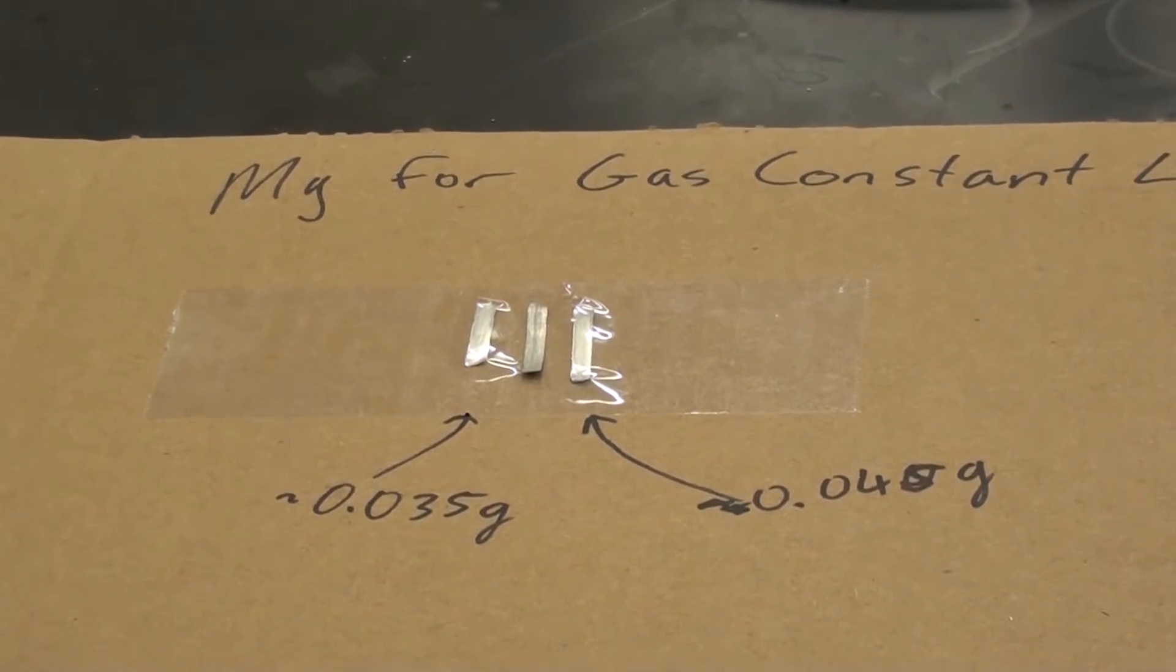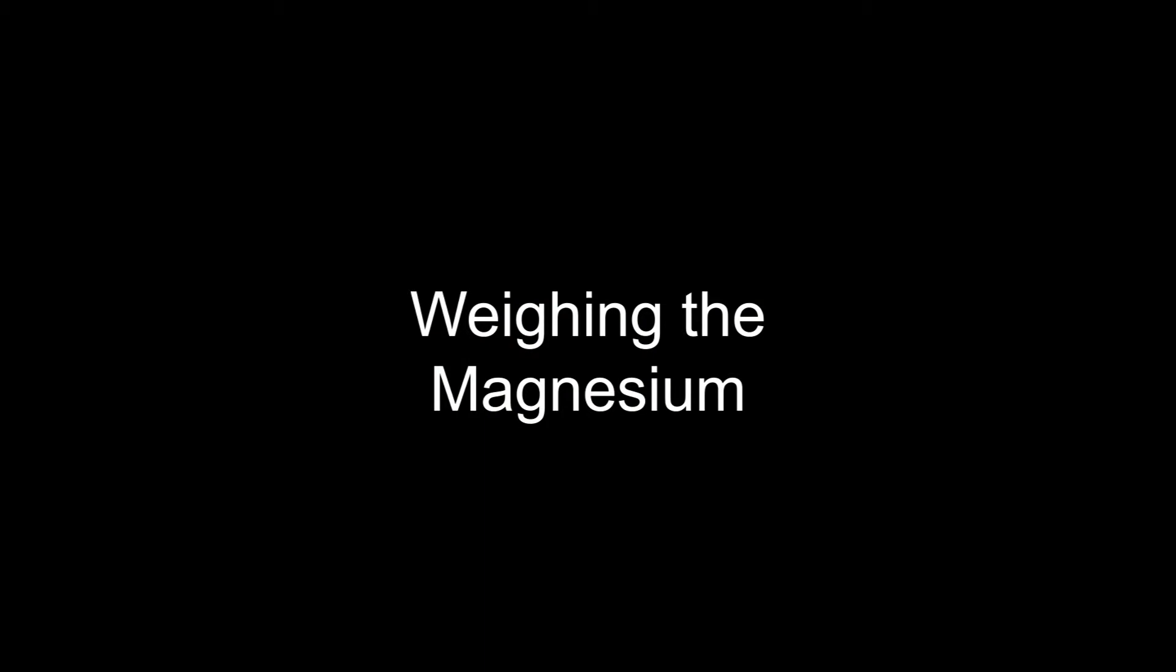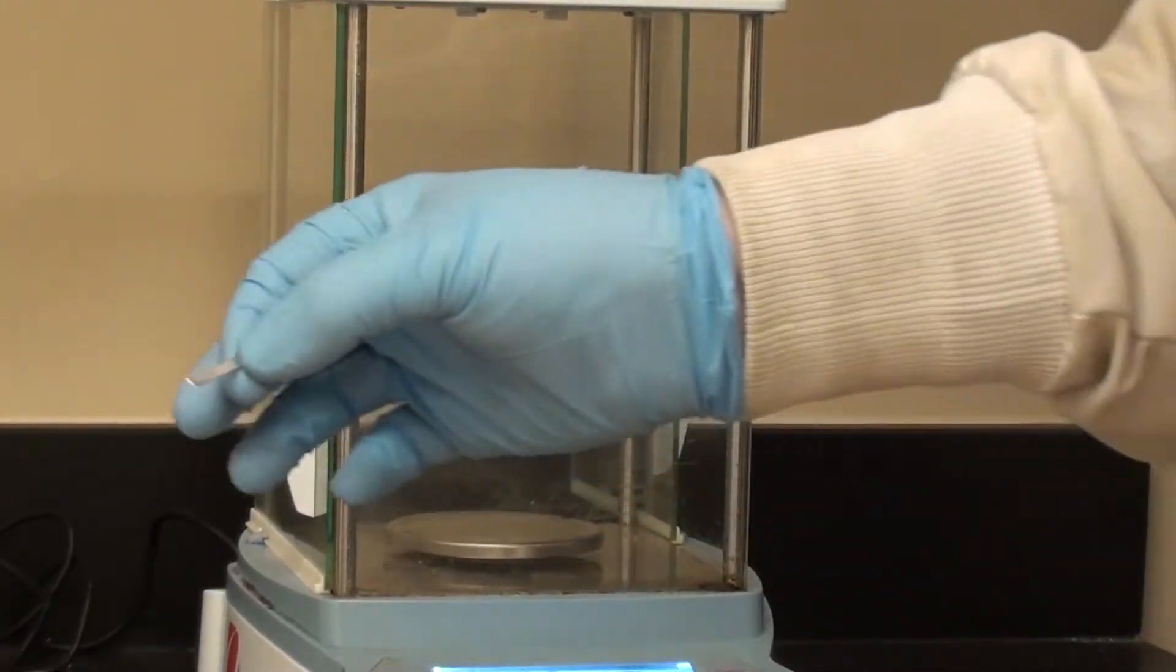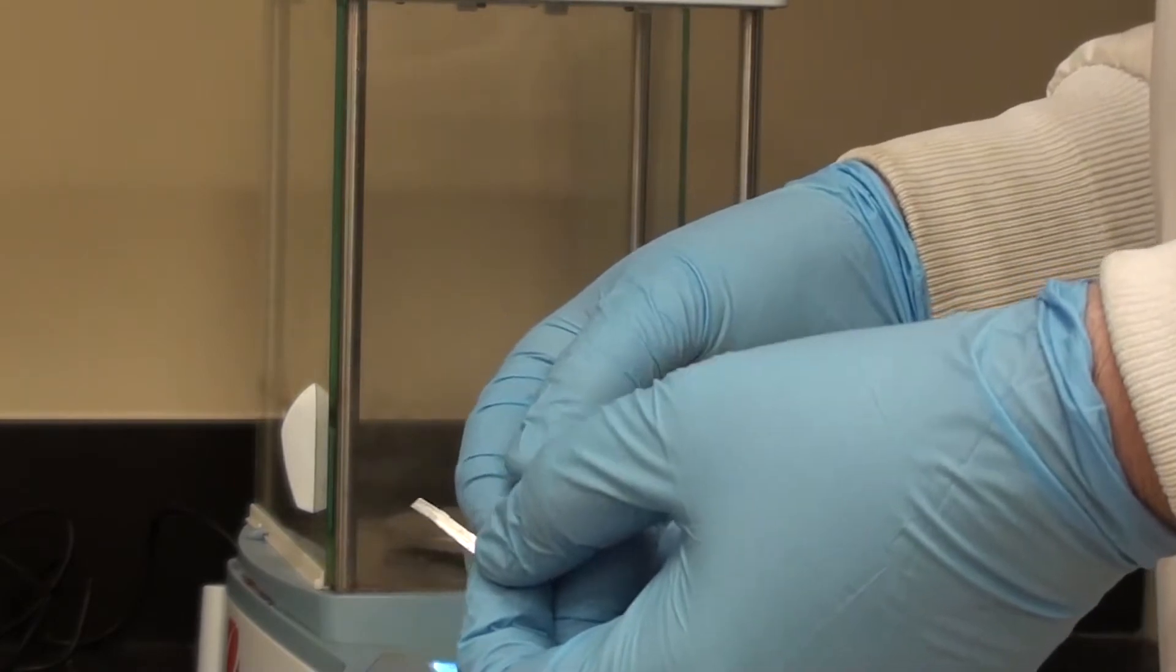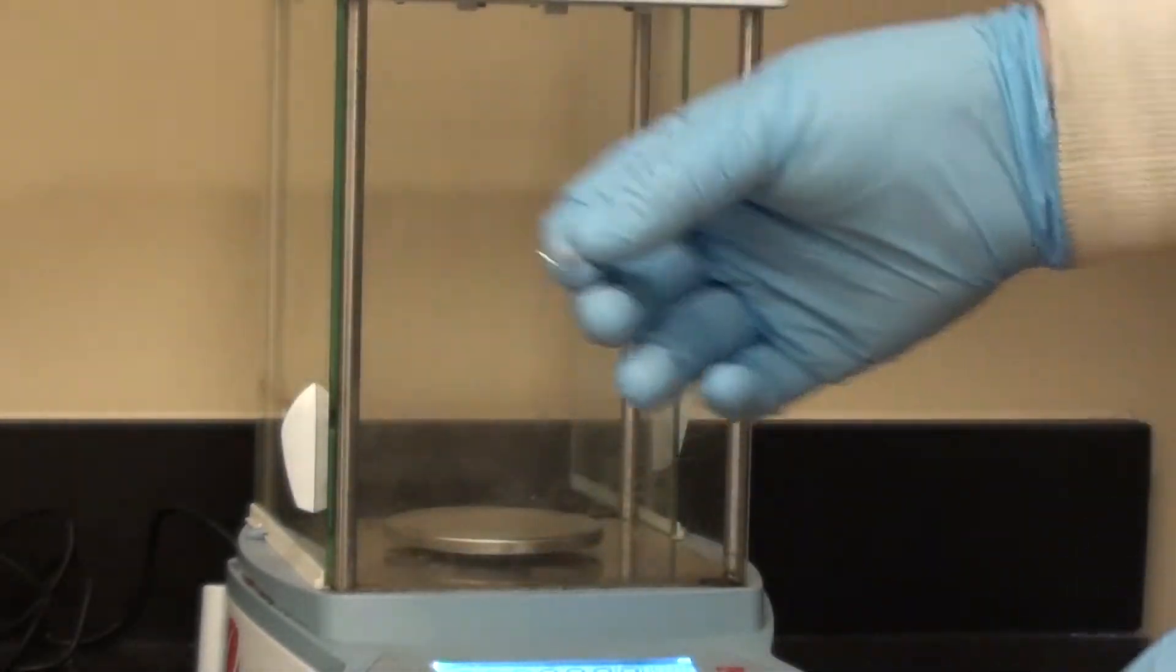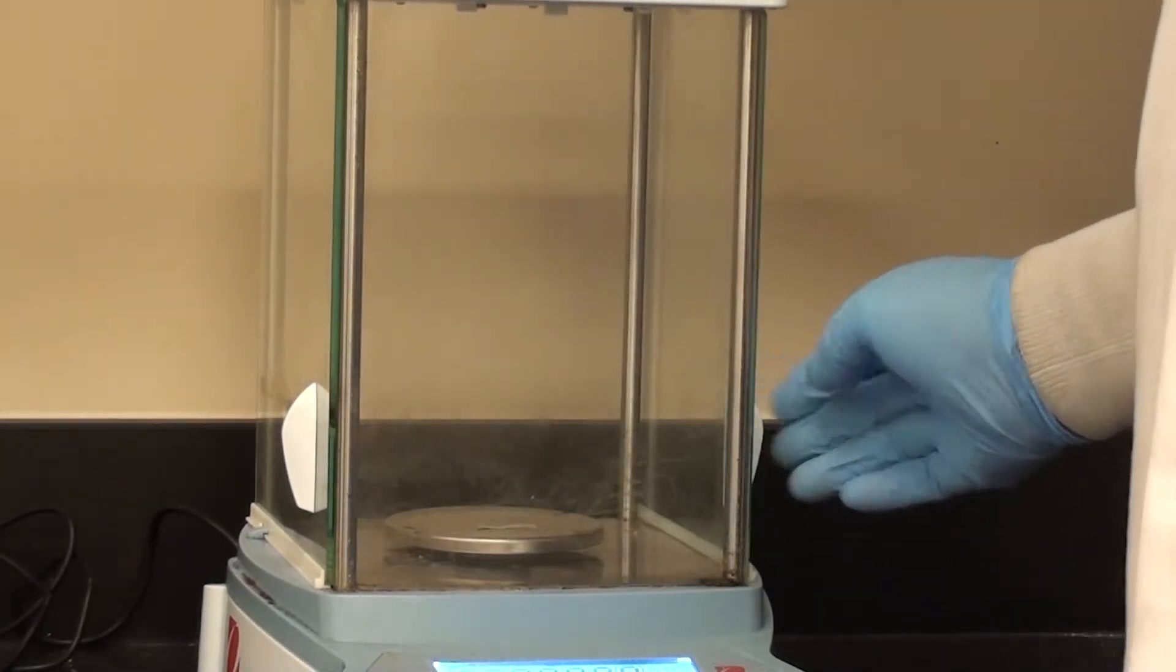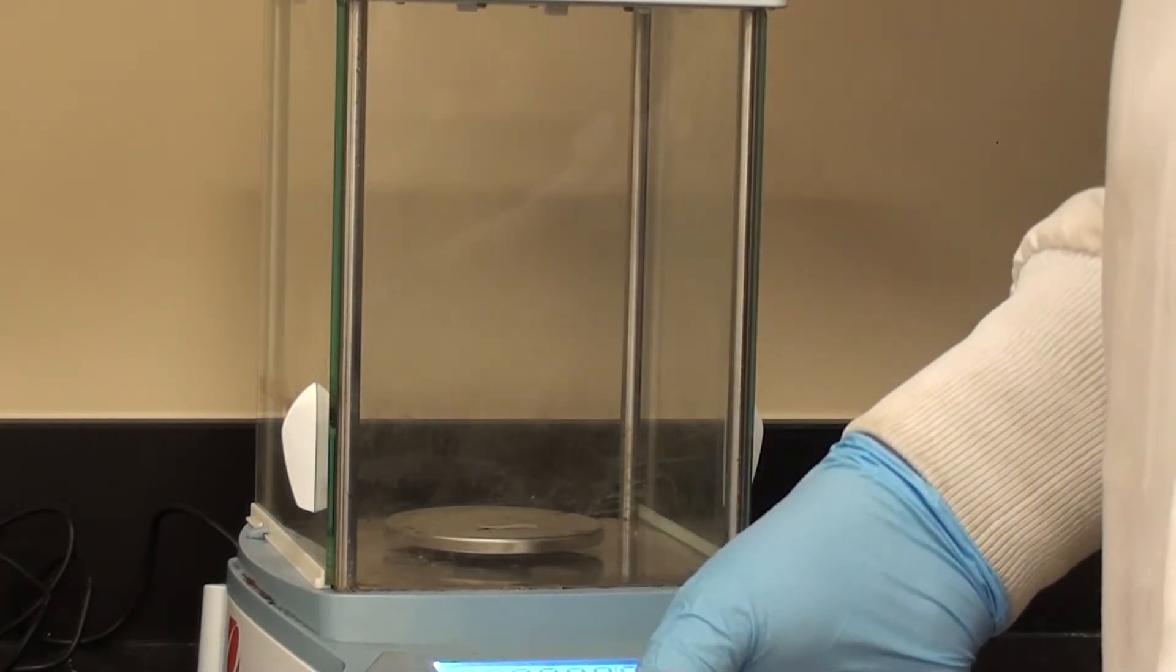So now we're going to take that and weigh it. Here's my cut piece of magnesium. It says in the directions it's probably a good idea to sand it as well, that's before you weigh it. Then after you've sanded it, you can put it on the balance. And just note the mass, it should be somewhere between 0.035 grams and 0.045 grams.